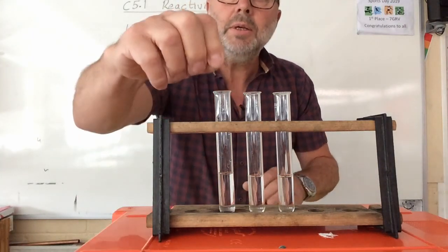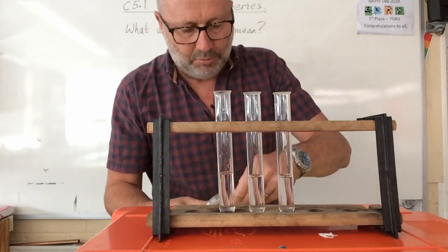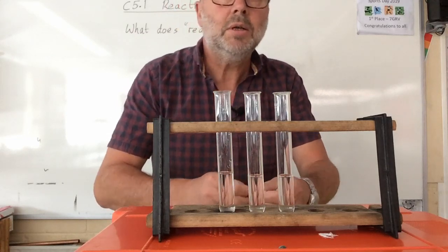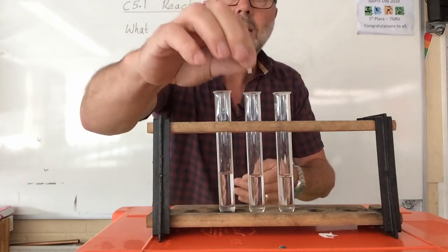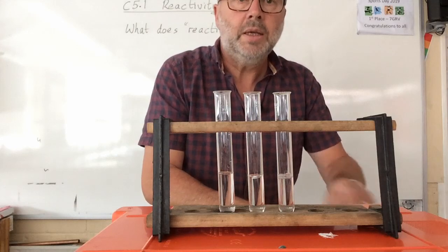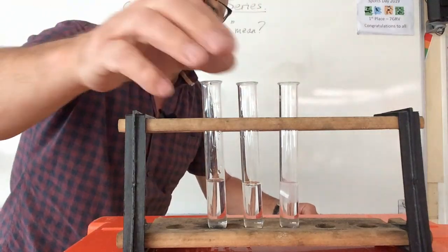So I'm going to put some zinc in that one. There it goes. I am going to put some aluminium in the other one, which is closed up. Let's get some of that out there. There's a piece of aluminium. Should have practiced this. Aluminium goes in there, and then I'm going to have a piece of magnesium that goes in there. Now straight away, what can we see here? We can see that the magnesium is very, very fizzy.